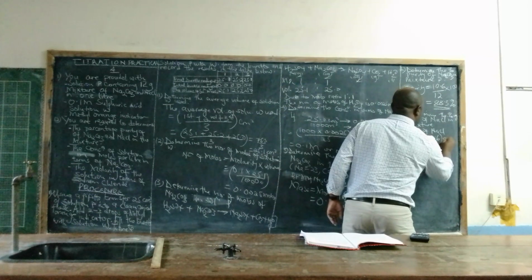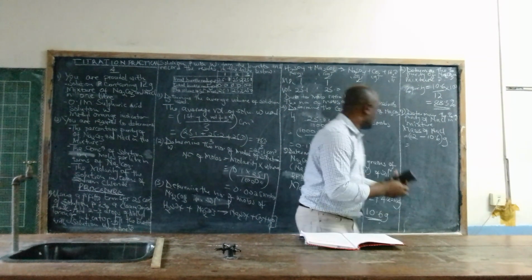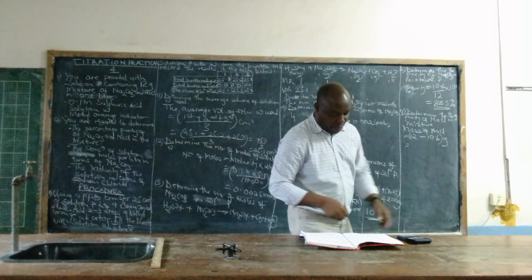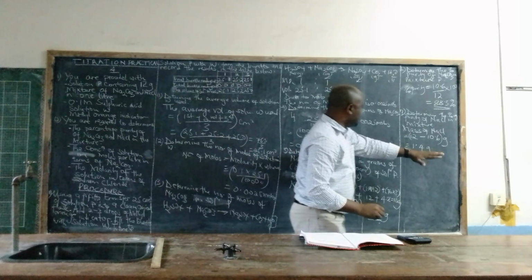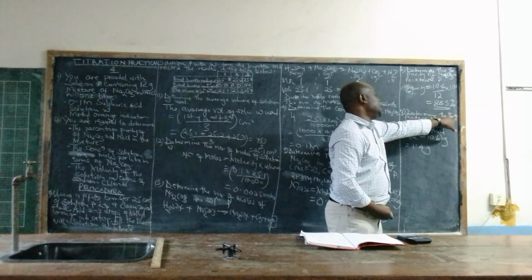Okay, all these are grams. So we are going to get 12 minus 10.6, which is 1.4 grams.